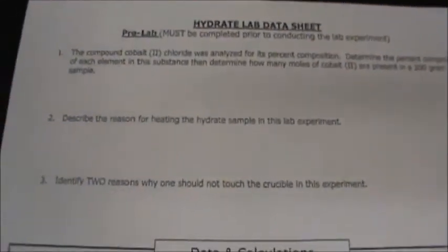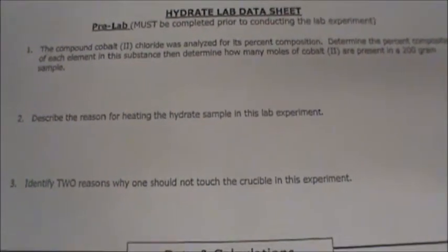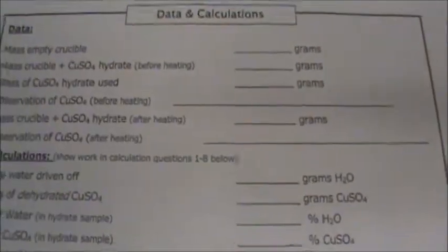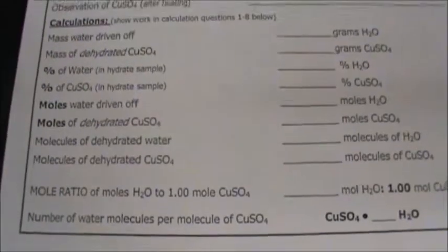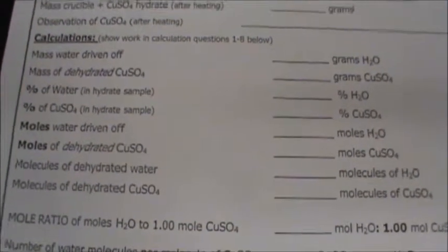There should be some pre-lab questions that you completed, and if you had questions you can email me over the weekend. And then afterwards we're going to be filling in this data table. Now the very top of it, as it says right there, is the data we're going to collect during the procedure. The other section is the calculation section. This is where you will fill in all of your answers.